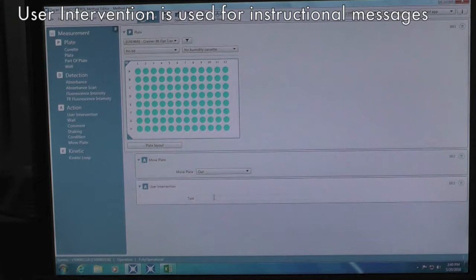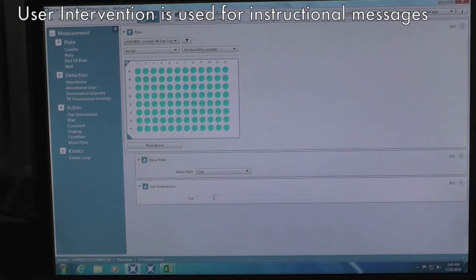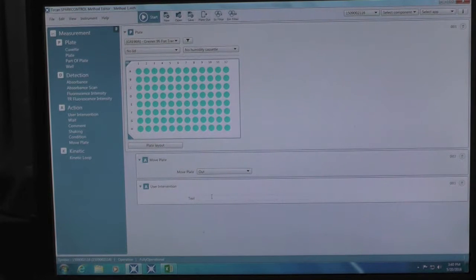There are also other user interventions that may be useful. For example, you can type in a message to direct the user to add reactants to the plates. And once complete, the sequence will continue to read the plate.